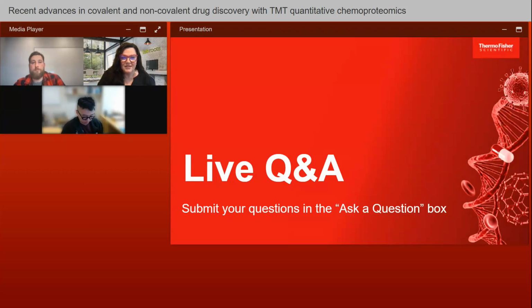Right. Thank you for that. The next question: you described the missing value challenge for ABPP and showed how GoDig can address this for a targeted set of peptides. Would increased fractionation, FAIMS, or DIA help with missing values too? Yeah, I guess a question for me. Yes, totally.